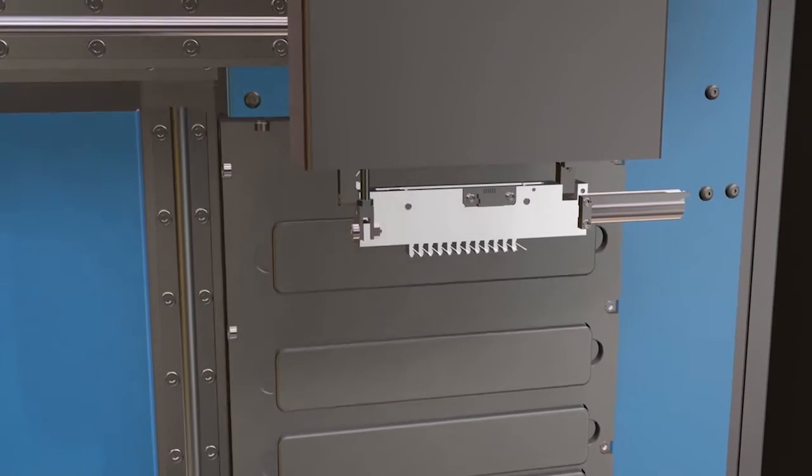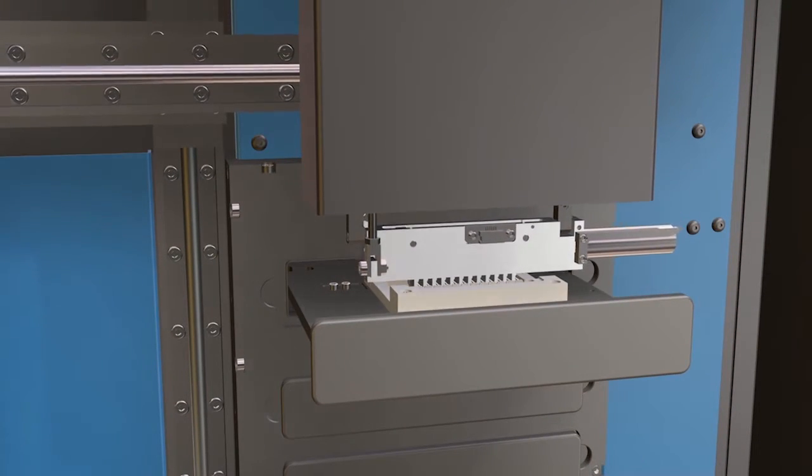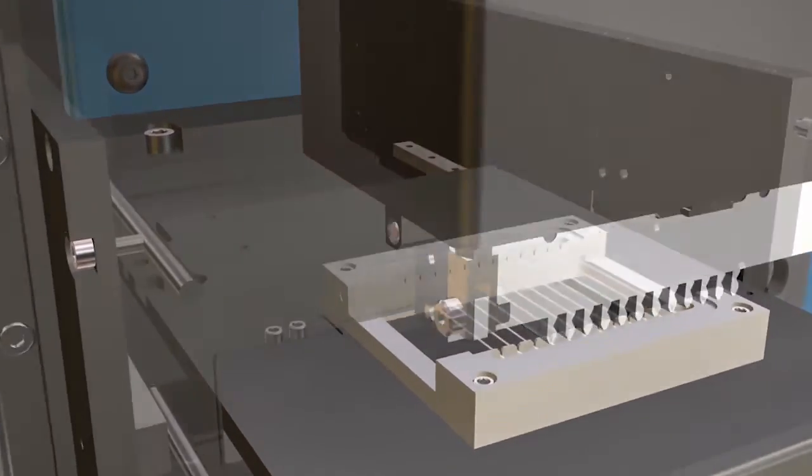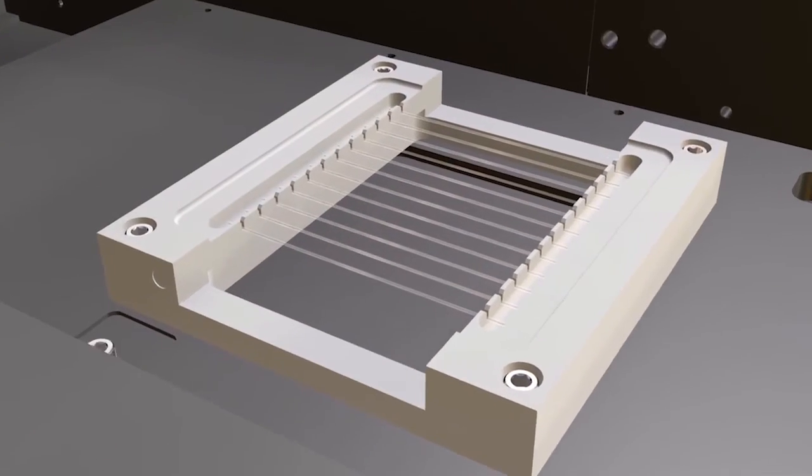The capillaries are placed into the separation tray, where a voltage is applied across each capillary to enable separation by molecular weight.